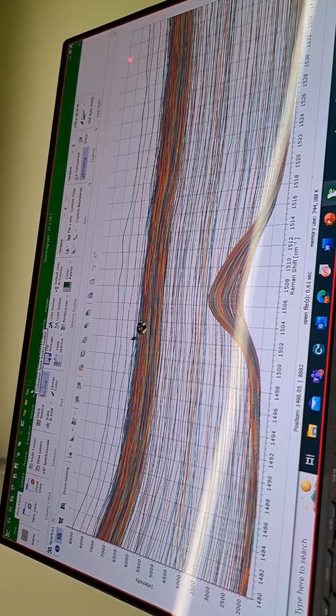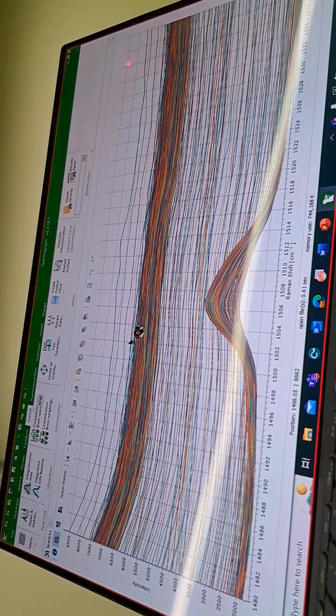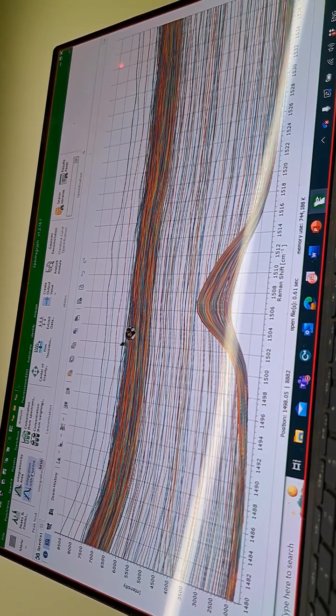So this should now be all of the spectrum in that area. Okay. Background is very different at different points. And integration of baseline.